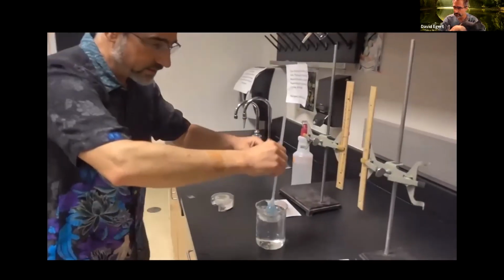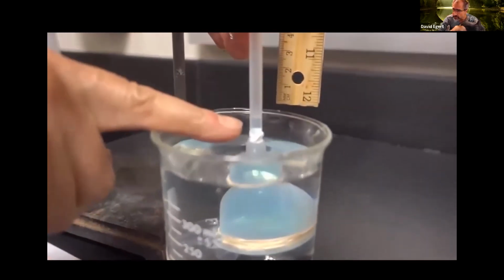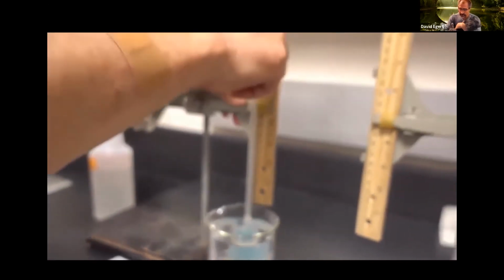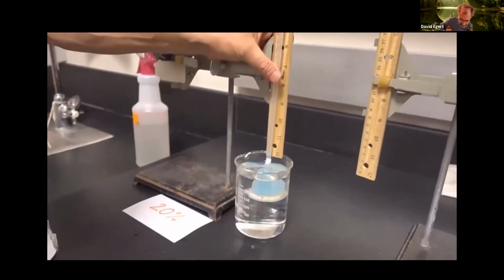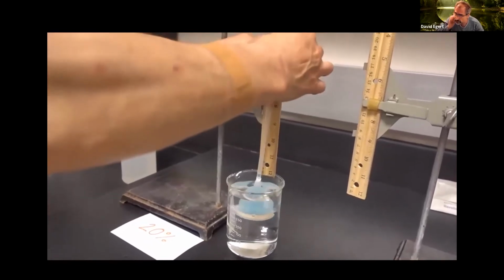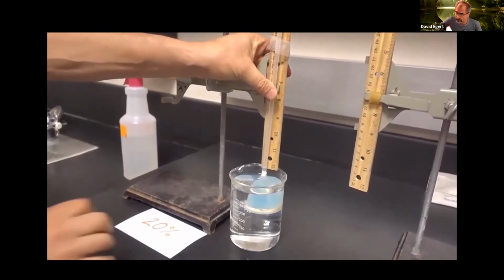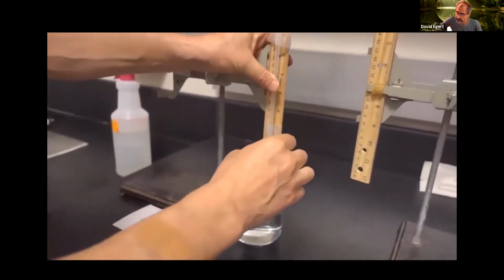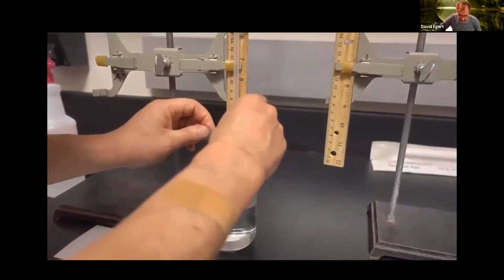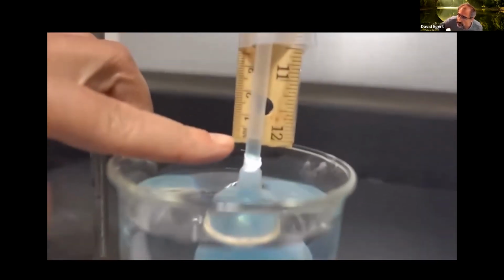Now I'm sticking this in here, and that's what I want to see. So at time equals 0, you can see the water is at this level up the tube. And because that's basically my time equals 0, I want to tape this onto the ruler such that any amount of water that crosses the membrane and enters the thistle tube, which is going to drive the movement of the water up the tube, will be super easy to measure because it's 0 right now.